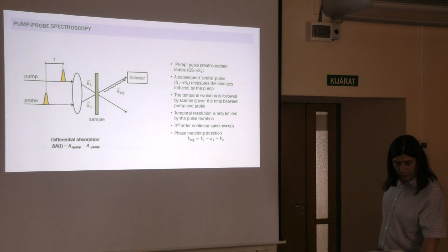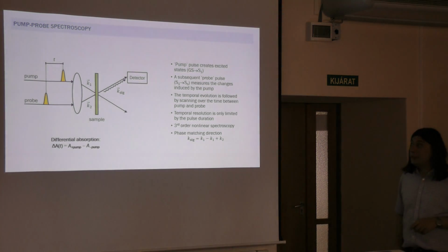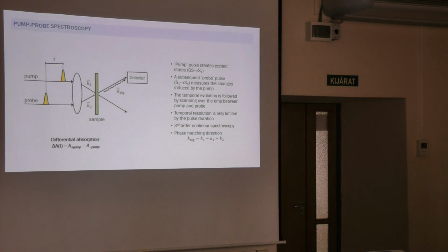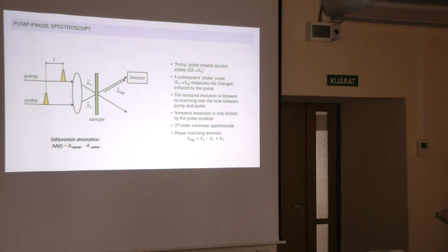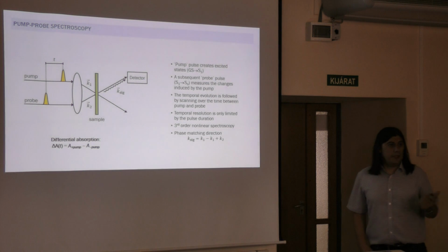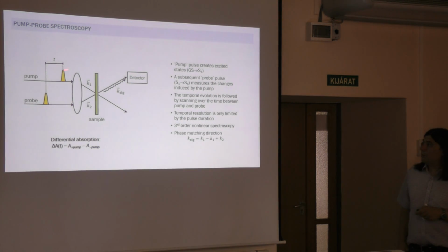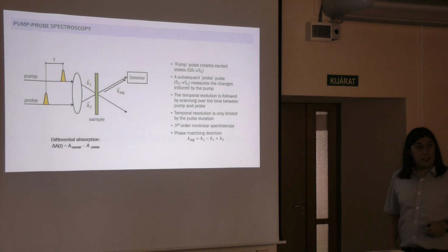Okay. Now, we can move on to try to see how we can actually study these processes, right? And I will remind the principle of the pump probe spectroscopy, which is like the classic. And so, if we want to study the dynamics, first of all, we need maybe short laser pulses that can define sharp periods of time when we can start the kinetics of the system.